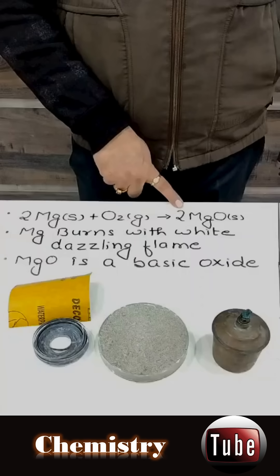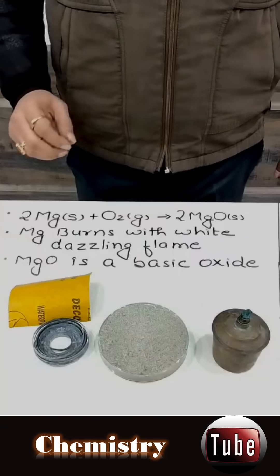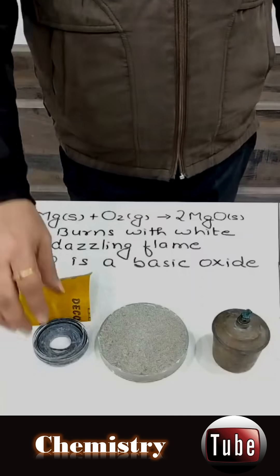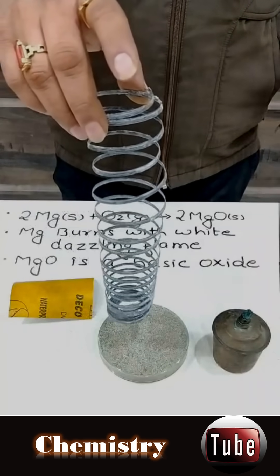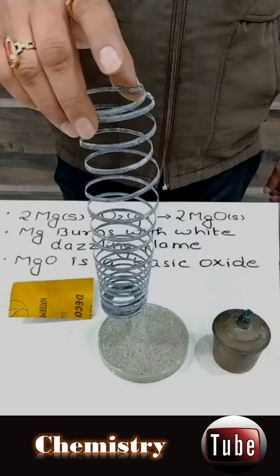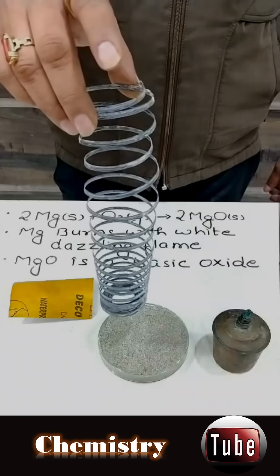Magnesium oxide looks like a white powder and when magnesium burns, it burns with a white dazzling flame. But the issue is that magnesium develops a layer of oxide, magnesium oxide on its surface. This magnesium oxide layer prevents magnesium from burning.